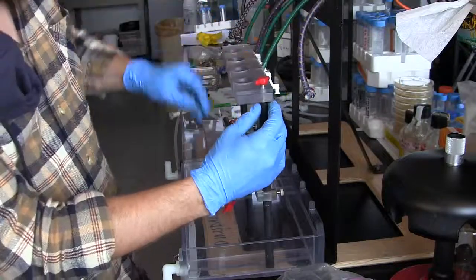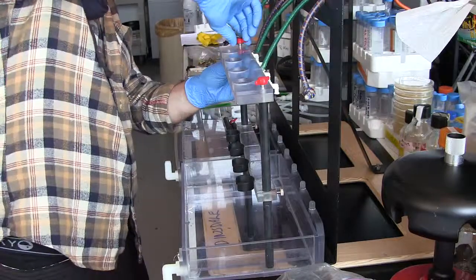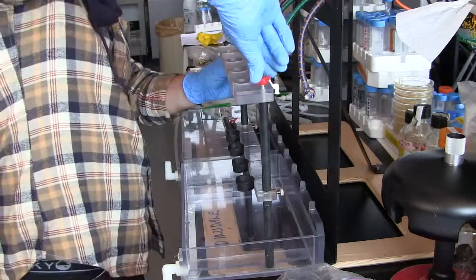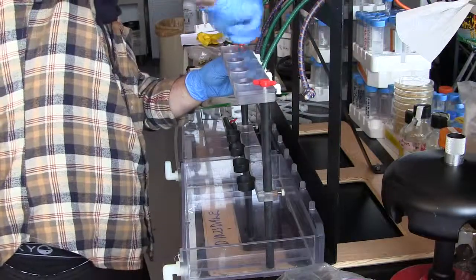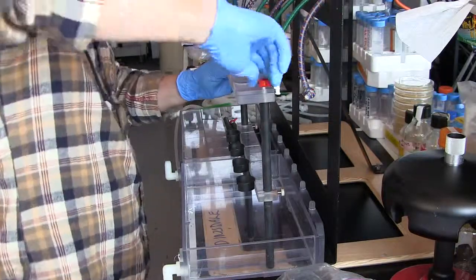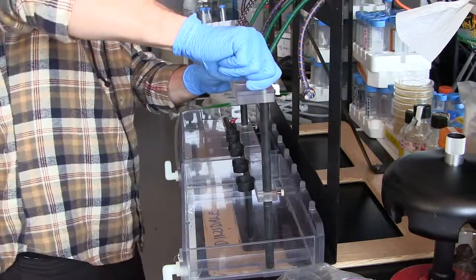Here's one. See again how I'm not screwing it in all the way when I do the first one. I wait until I've got them both screwed in part way, lined up, and then I come back and tighten properly. Right? I always try and tighten both a little bit, so you don't end up just ramming one in at a wrong angle.